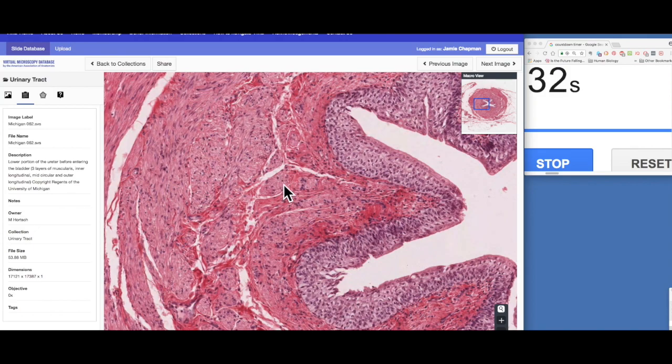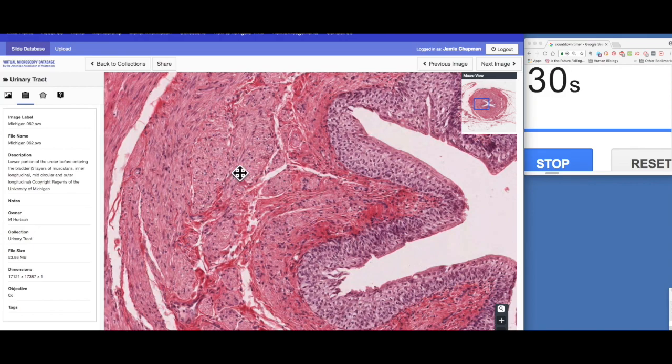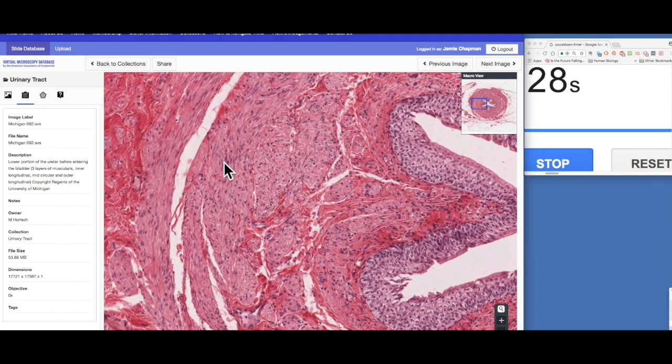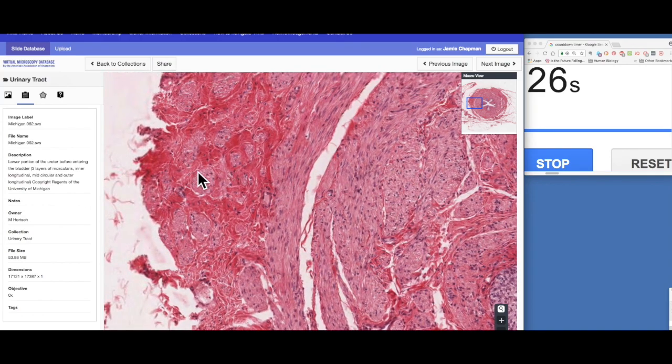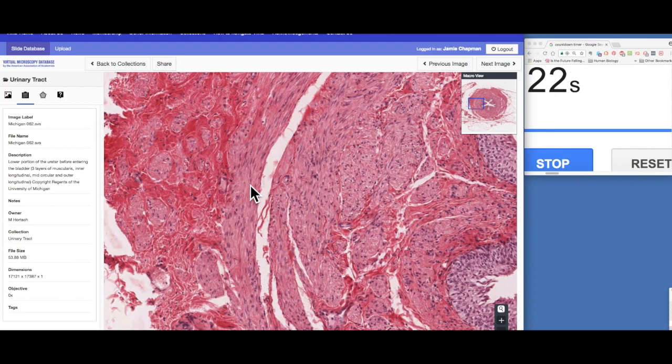So here we've got our inner longitudinal layer of smooth muscle. We come out here, we've got a middle circular layer. And then we come out here again to the outermost, we've got another longitudinal layer. Again, these three layers are very particularly localized just close to the urinary bladder because the urinary bladder also has three layers of smooth muscle in this similar arrangement.